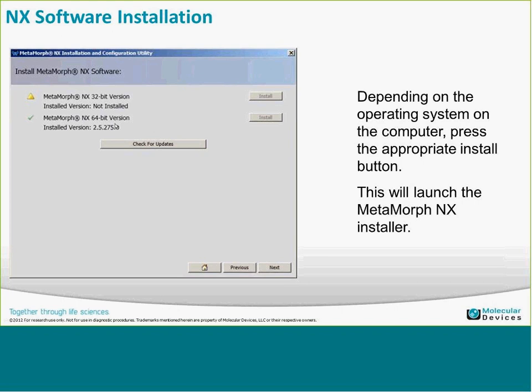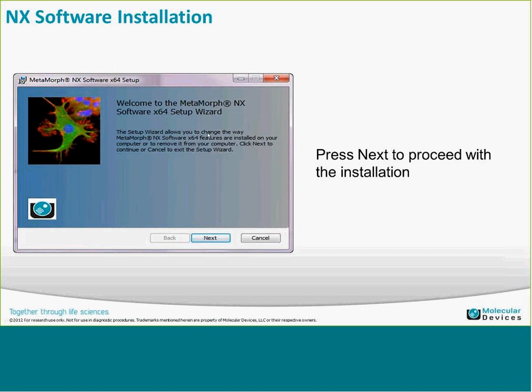To actually install the NX software, once you've clicked on the install for the specific version, the installer launches — in this case the 64-bit installer. Click Next to proceed, accept the license agreement, and then select Typical for the install. Complete adds a few things mostly used by programmers. For most installations, use the Typical option. Click Install, watch the progress bar, then click Finish when done.